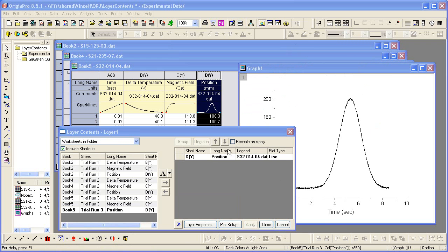The right panel shows you the dataset currently displayed in the plot, while the left panel shows you the datasets that are available for plotting in the current subset of the project.